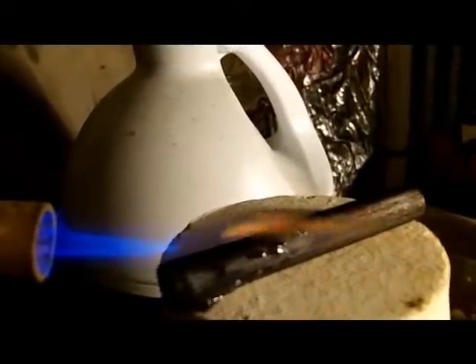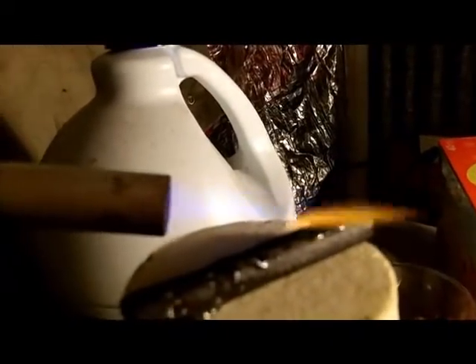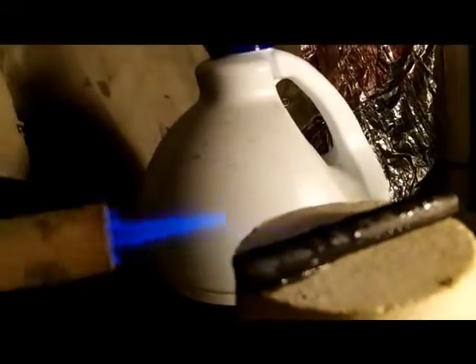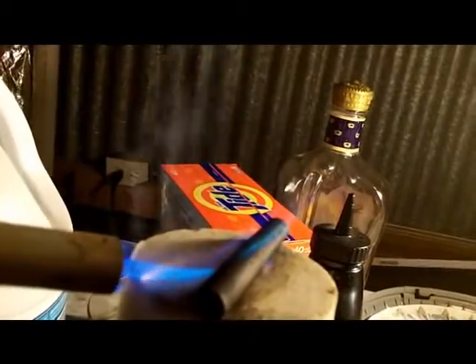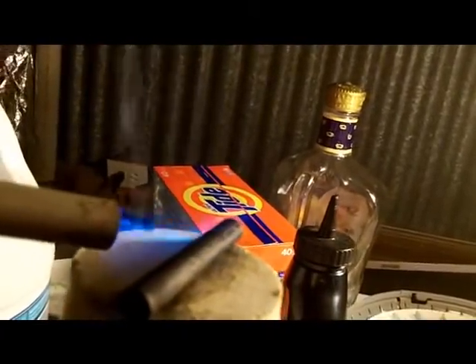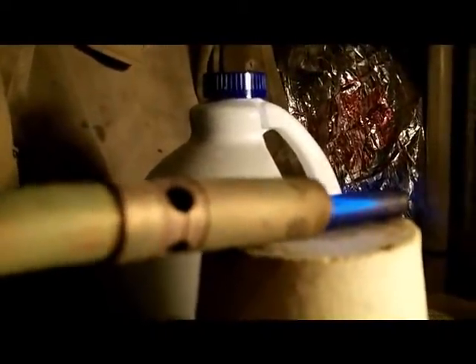These graphite electrodes from a dead desal battery have a lot of uses. Graphite products are not necessarily cheap. These are good for what we're using them for — obviously as an anode, for electroplating, and just really for metal recovery.